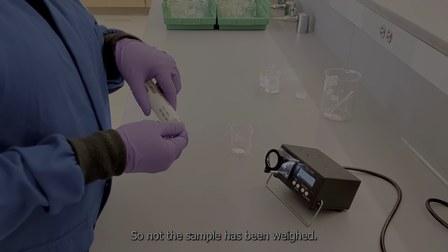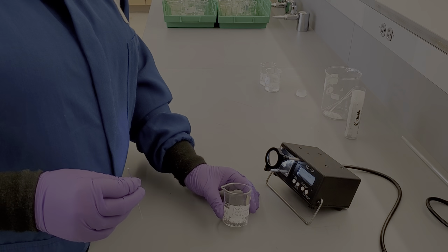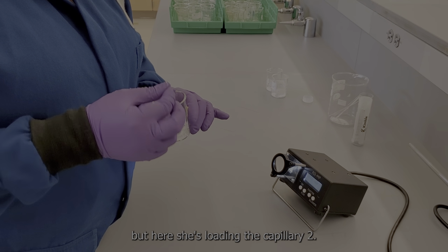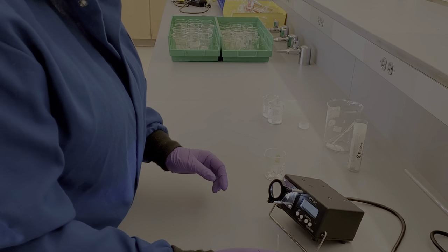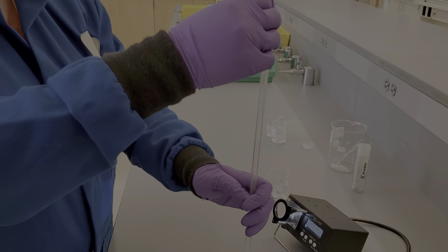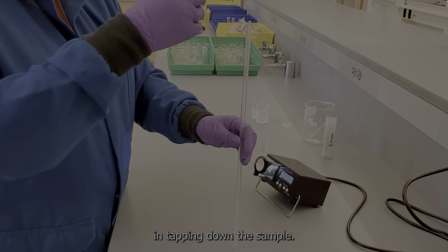So now that the sample has been weighed, Tara can go on and do her melting point analysis. As she's already introduced this technique before, I won't be going in depth, but here she's loading the capillary tube and making sure she has enough sample to get a good reading. And now she's tapping her sample to the bottom of the tube. You can use this to assist you in tapping down the sample.